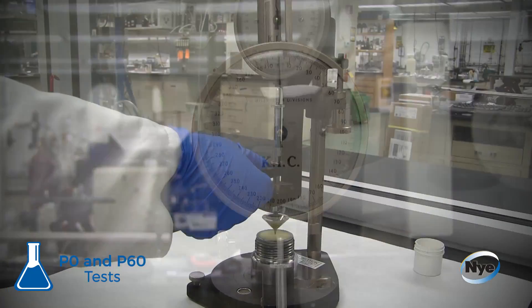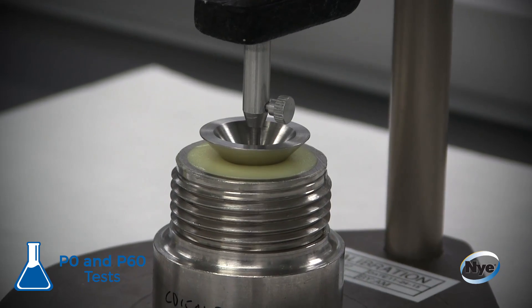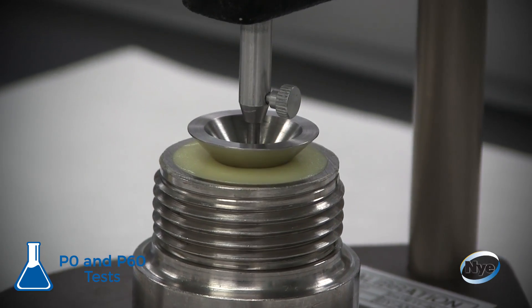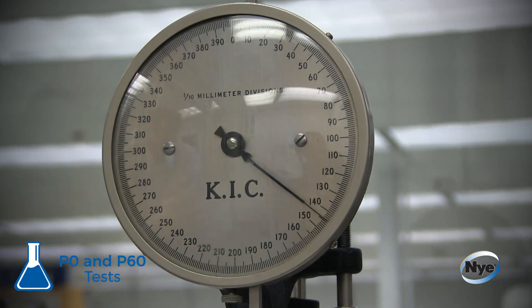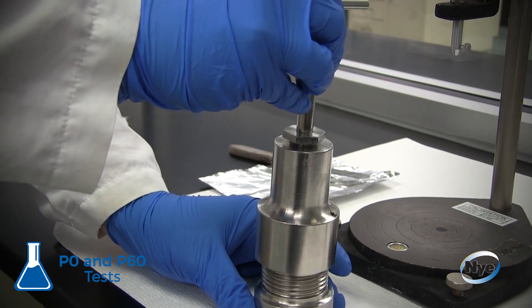Using a penetrometer, a cone is dropped into the cup for five seconds, creating a hole in the grease. The technician records the depth, in tenths of a millimeter, of this hole. This value is known as the P0, or unworked penetration.